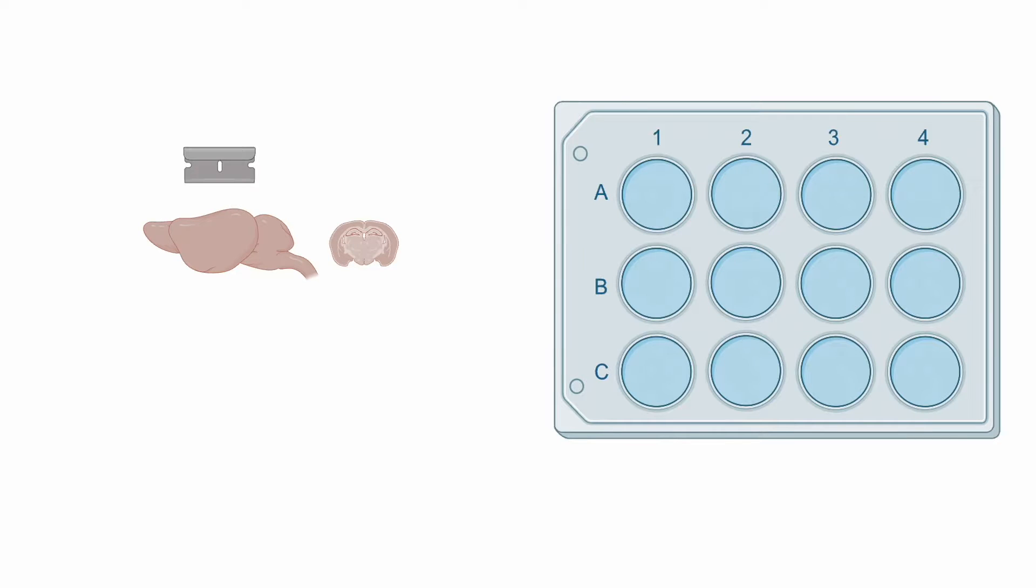A vibratome, or vibrating microtome, is an instrument that can cut extremely thin sections of tissue with high precision and accuracy by using a vibrating razor blade.